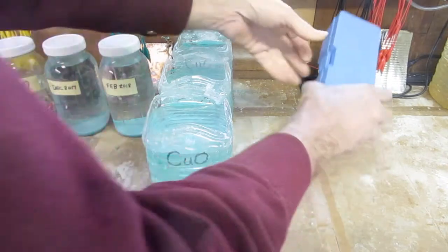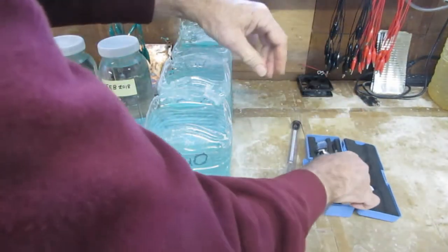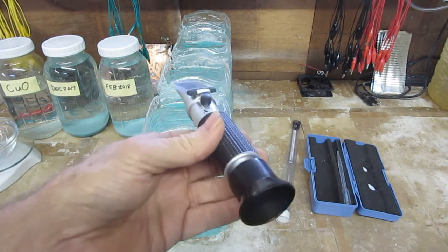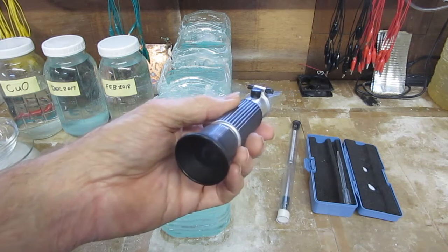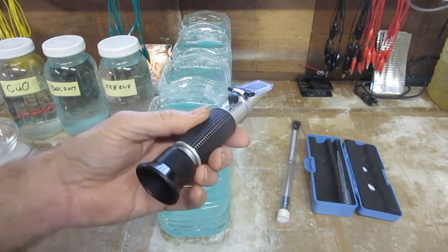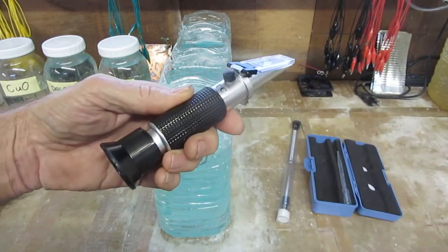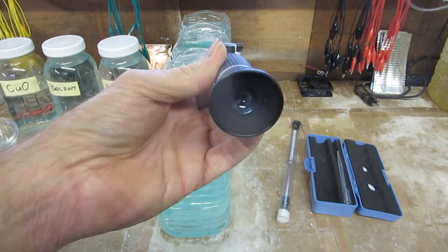Now there's another tool that I have here. It's called an optical refractometer. Now this is also very inexpensive, and they're quite common now, and so it's very easy to use, and it does read salinity directly off a scale that's inside here when you look inside this eyepiece. Now the way this works is you put a few drops of test water right here on this prism, and then you shut this cover, and then you look into this eyepiece into a bright light, and you will see a scale in there.